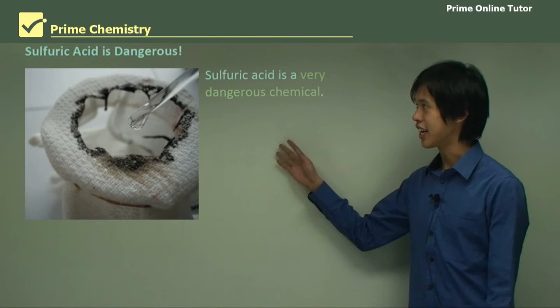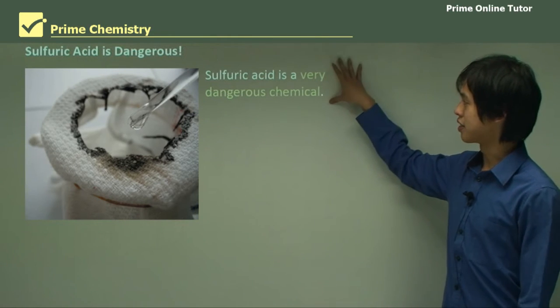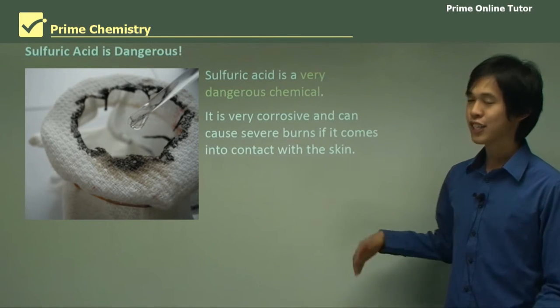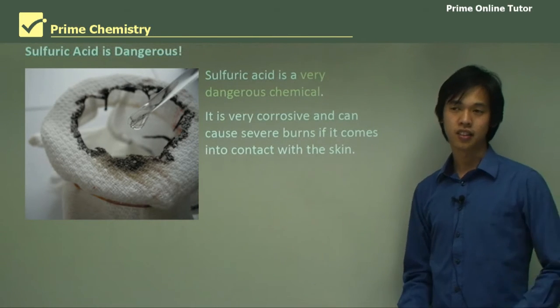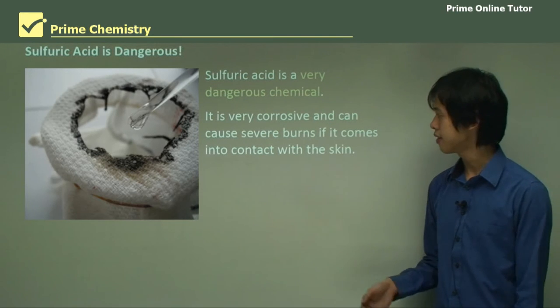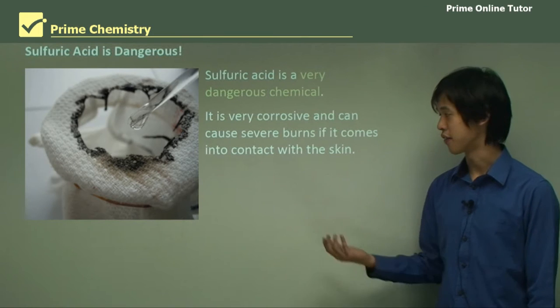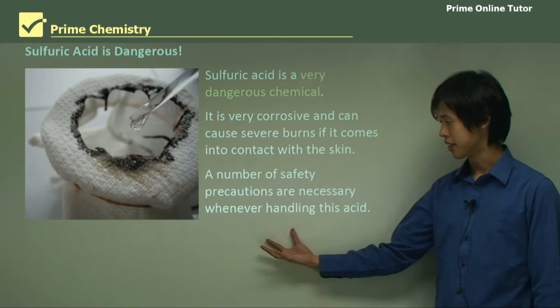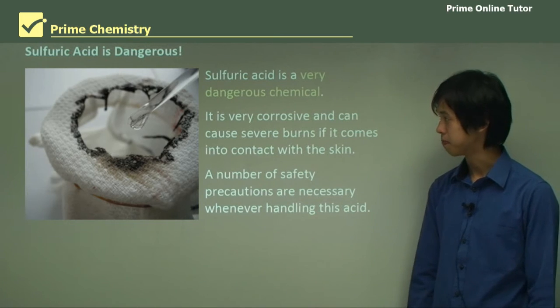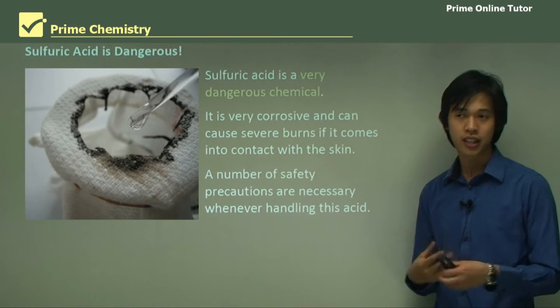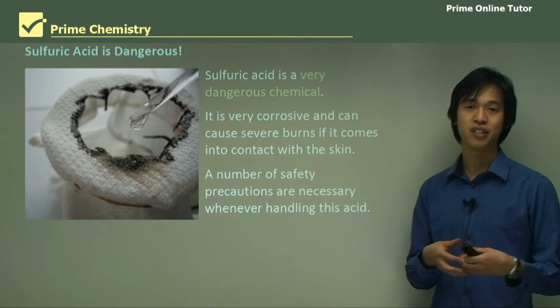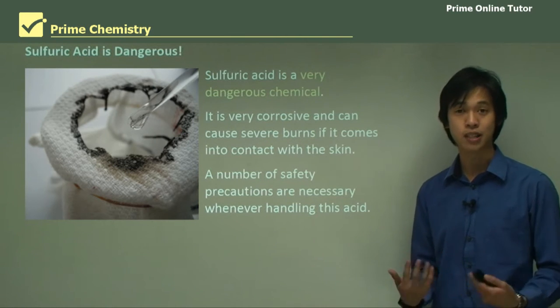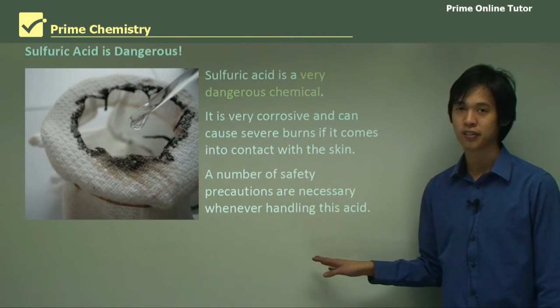First and foremost, sulfuric acid is dangerous because of various factors. It's a very dangerous chemical and it's very corrosive. Like many other acids and bases, it's extremely corrosive and it can cause severe burns if it comes into contact with the skin. It also absorbs water, and when it absorbs water it dilutes, and when it dilutes it releases a lot of heat. So not only does it cause chemical burns, it can cause actual physical or heat burns as well.